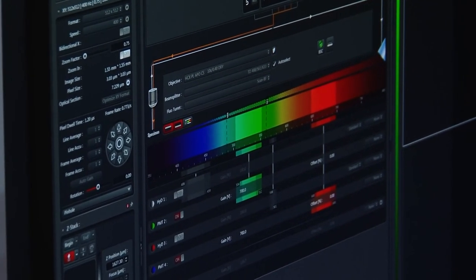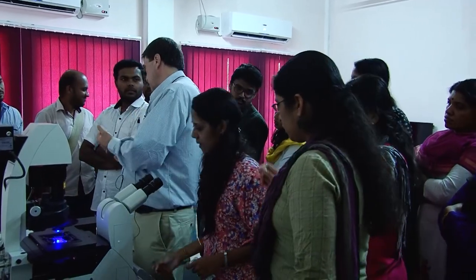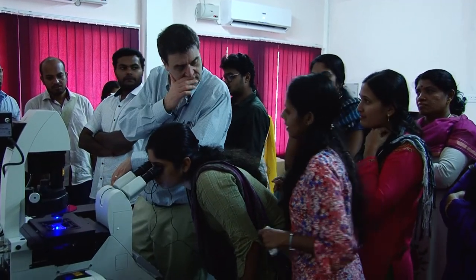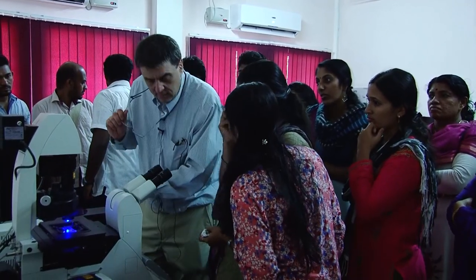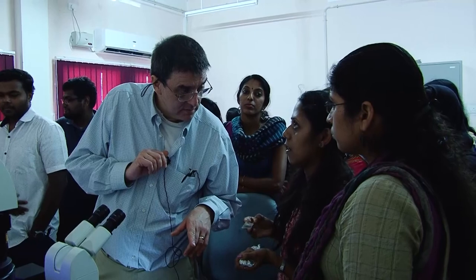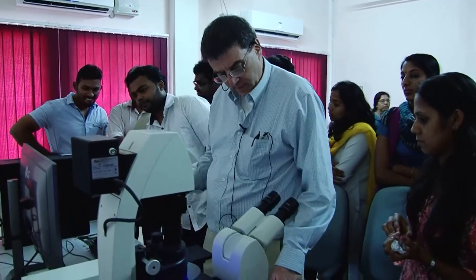Anything? No, it's not getting orange, but we're going to try it. Okay, so we're going to do blue, red, green, and so we're going to do, what was the red? What color? The red was called what? Alexa Fluor 488. 568. Okay, so let's run DAPI. So we'll run a 458.